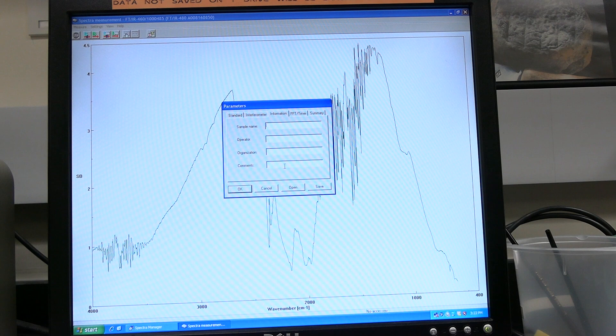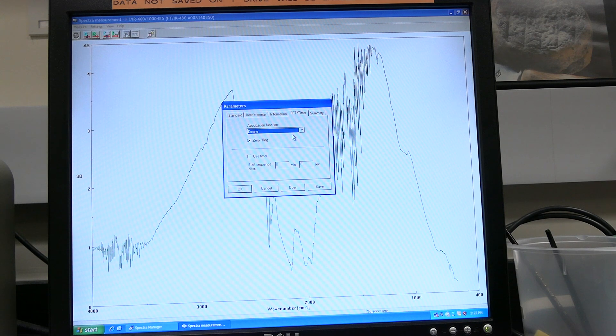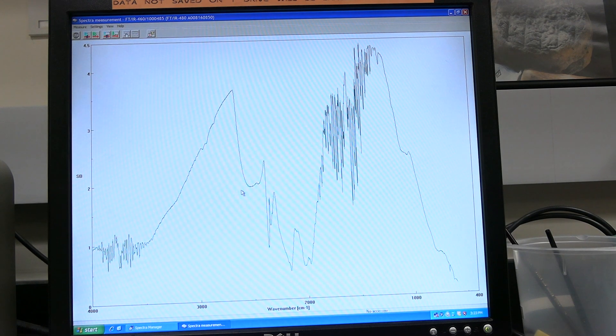Input the sample information. Click on the FFT slash timer tab. Apodization function should be set to cosine. Click on the summary tab. Click on OK to set the parameters.